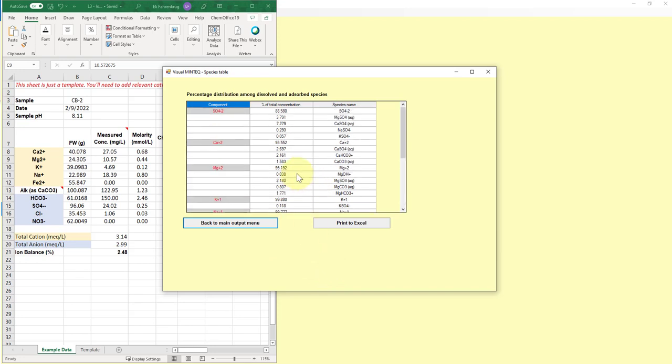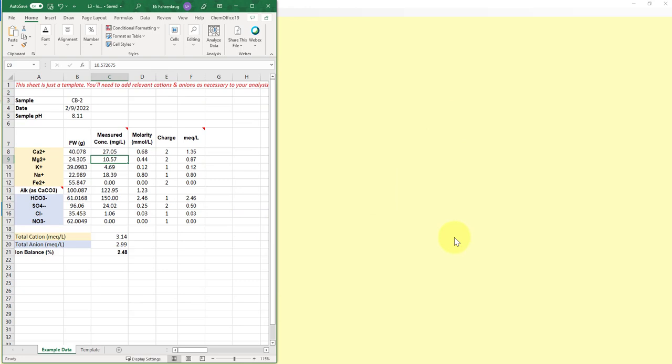So this is really great. You can take these data and you can put them into Excel, print to Excel. You can plot them and sort of get your speciation diagrams or log species diagrams, depending on what you want.